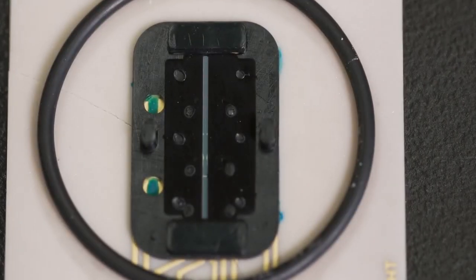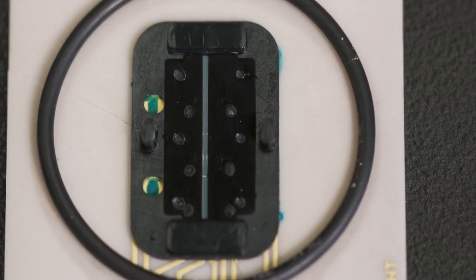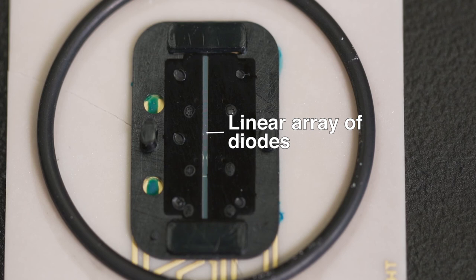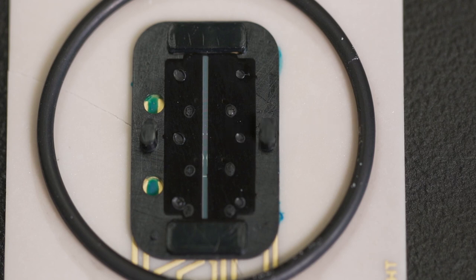The detector in this instrument is a diode array. The diode array is about one centimeter long, with 1024 individual detectors. The different wavelengths of light simultaneously strike different parts of the array. The signal is then digitized and sent through electronics to the computer.